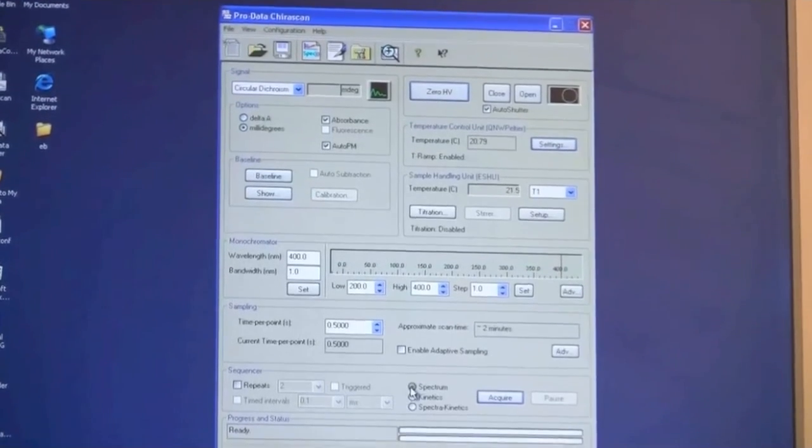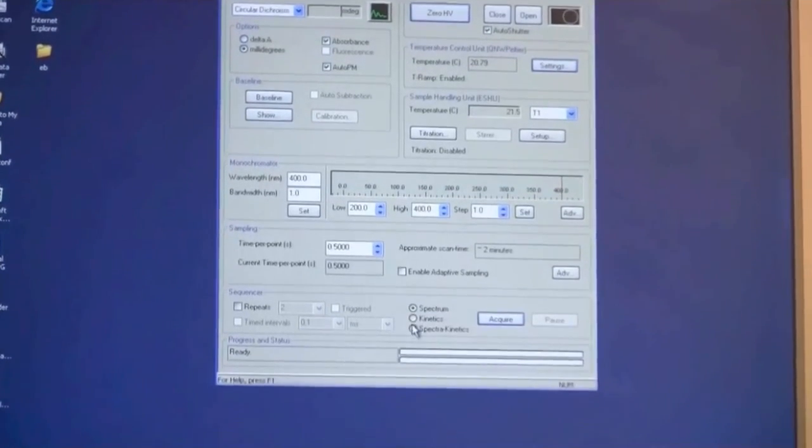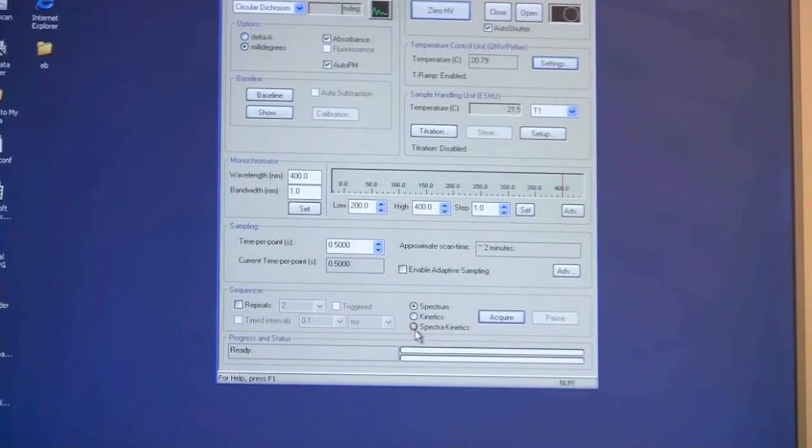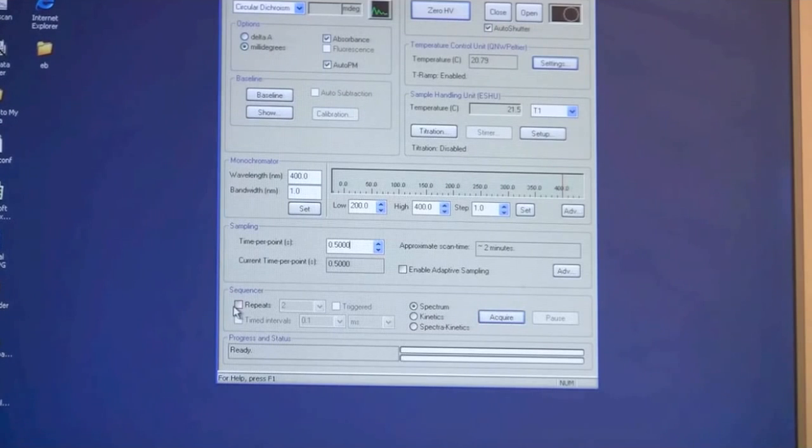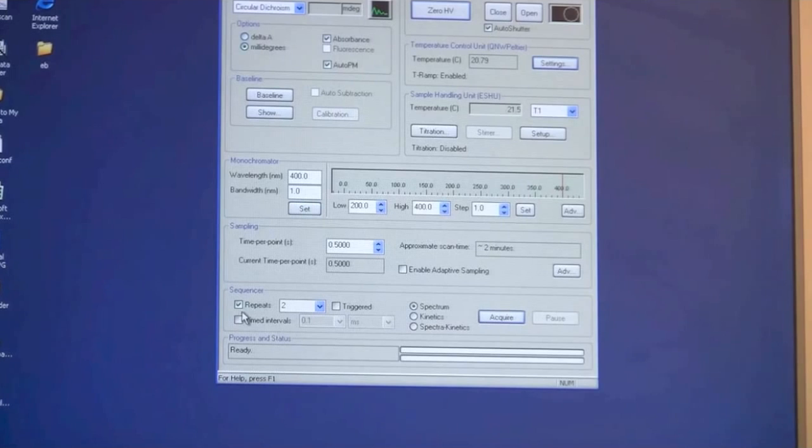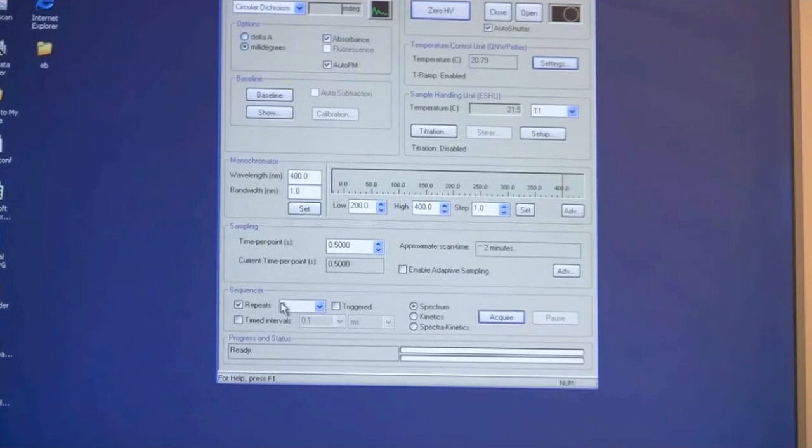Finally you have the option of doing kinetics or spectral kinetics if you should be interested in that. And you also have the option of choosing repeats if you want to repeat your experiment with the same sample and run more than one spectra.